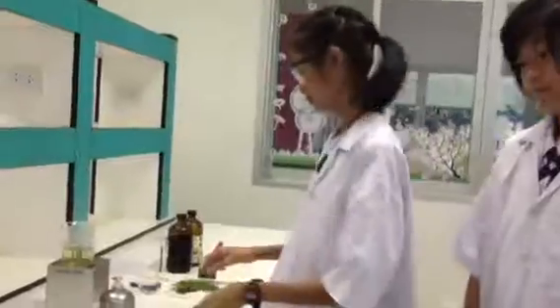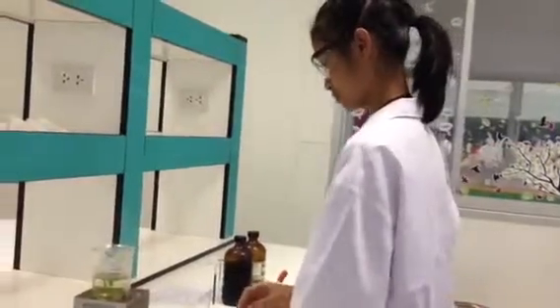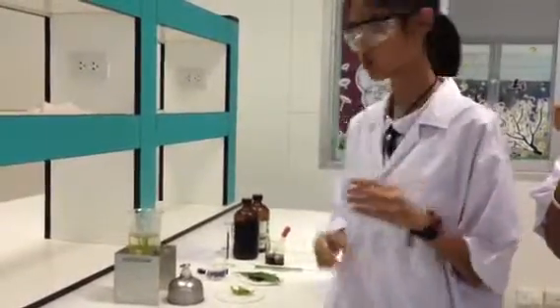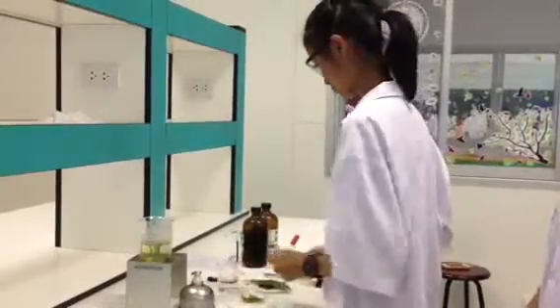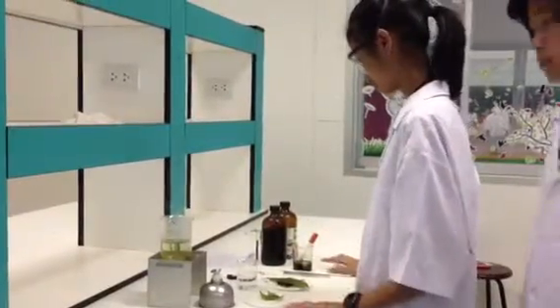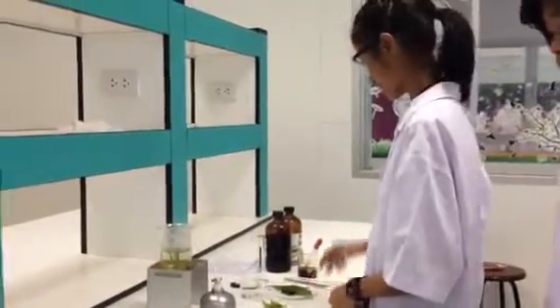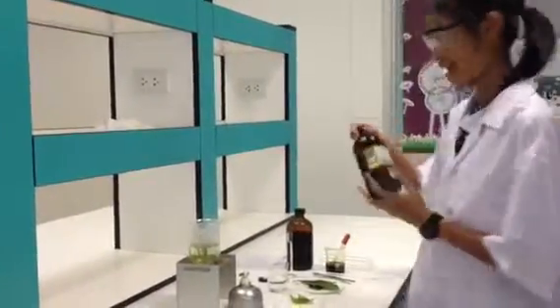Materials: Light Out, Trace, Leaf, Alcohol Burner, Test tube, Beaker, Cylinder, Clam, Iodine Solution, and Methyl Alcohol.